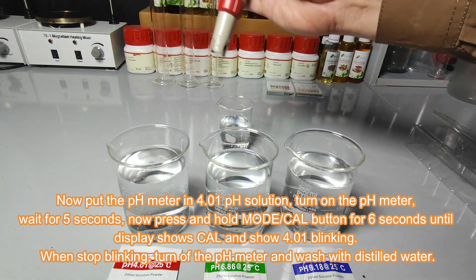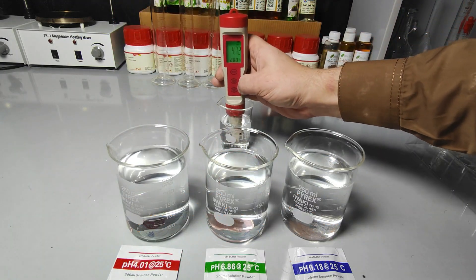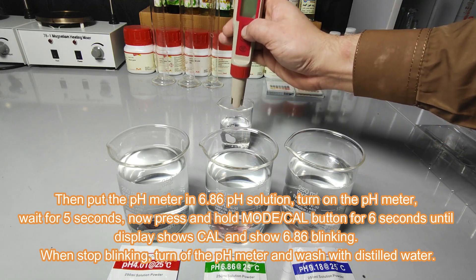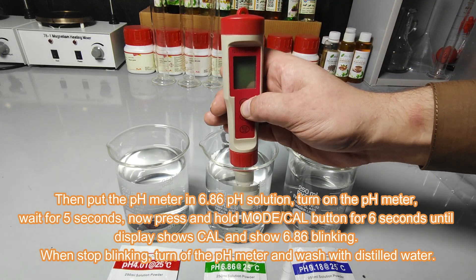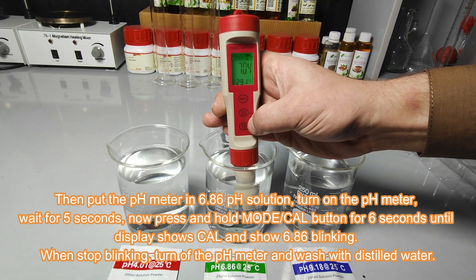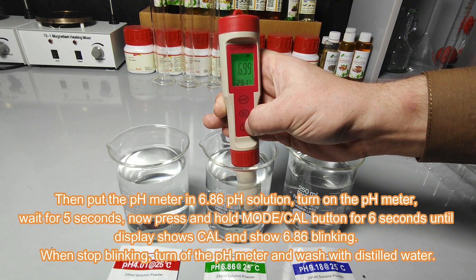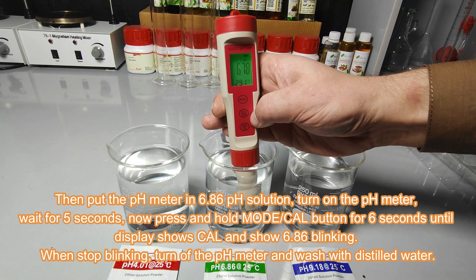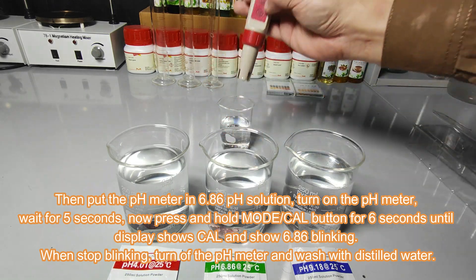Turn off the pH meter and wash the electrode with distilled water. Then put the pH meter in the 6.86 pH buffer solution and turn on the pH meter. Wait for 5 seconds, then press and hold the mode/cal button for 6 seconds until the pH meter display shows 'cal' and shows 6.86 blinking. When blinking stops, turn off the pH meter and wash with distilled water.